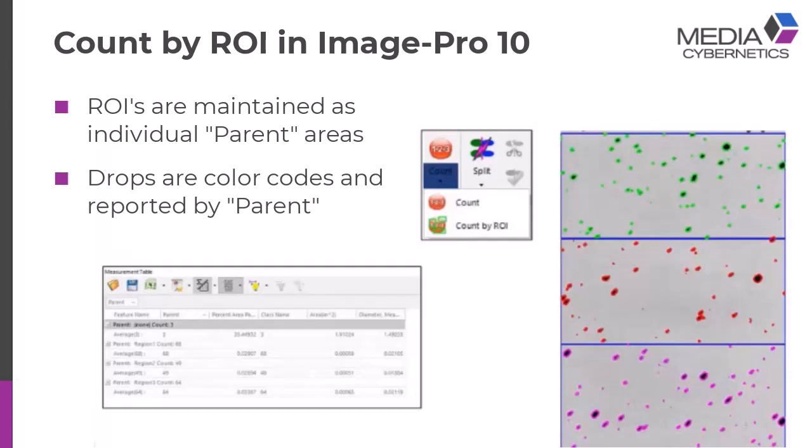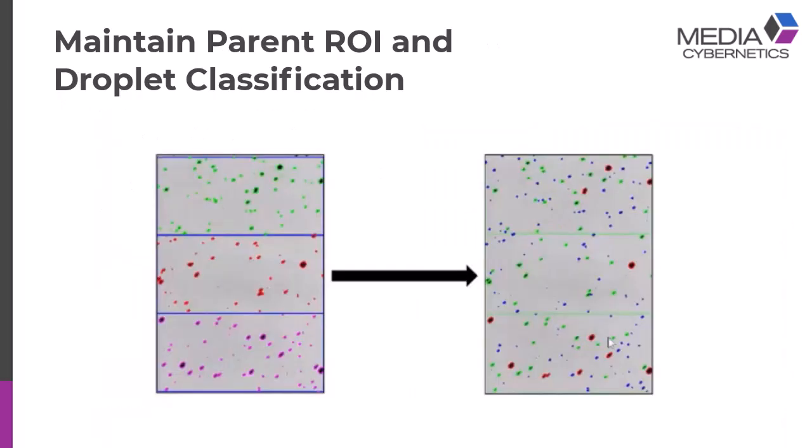So the question then becomes, what if you want to do a further analysis? How do you analyze if you want to do a distribution analysis within each of these regions? We work with some people recently doing exactly that, where they actually had to set up various regions, but then they had to do a distribution analysis, a single variable class by a single parameter—area, mean, intensity, whatever it may be—and then do that second classification. The question is, how do you do that? In this case, everything is the same right now.